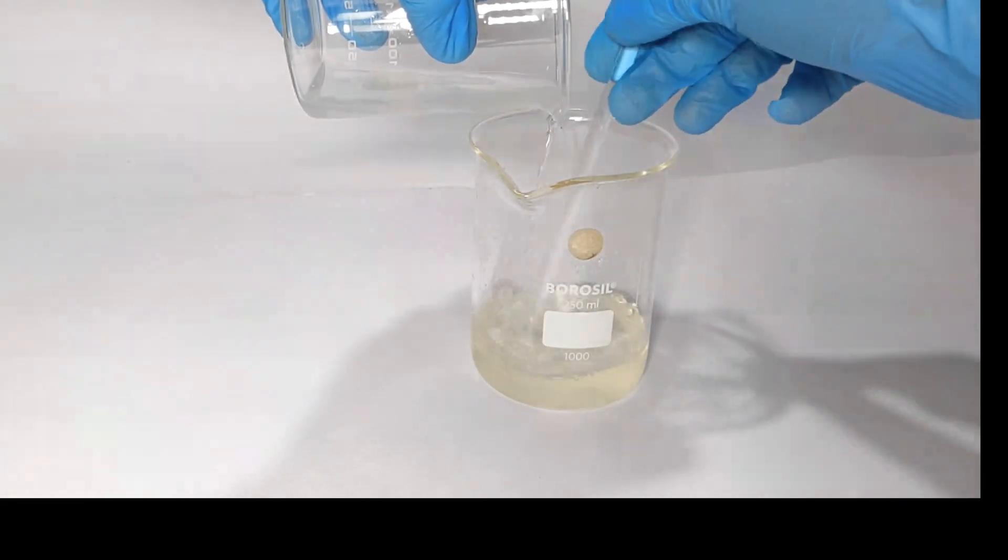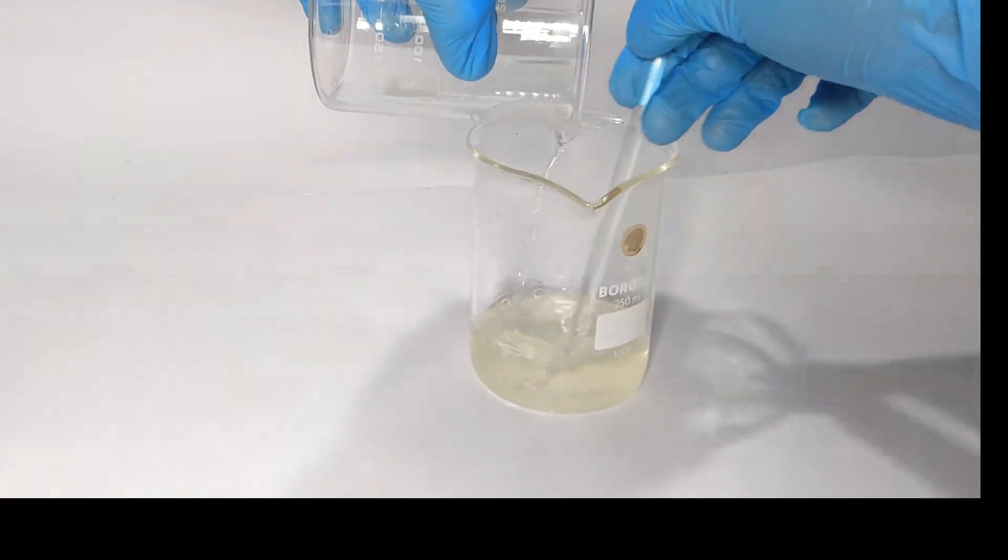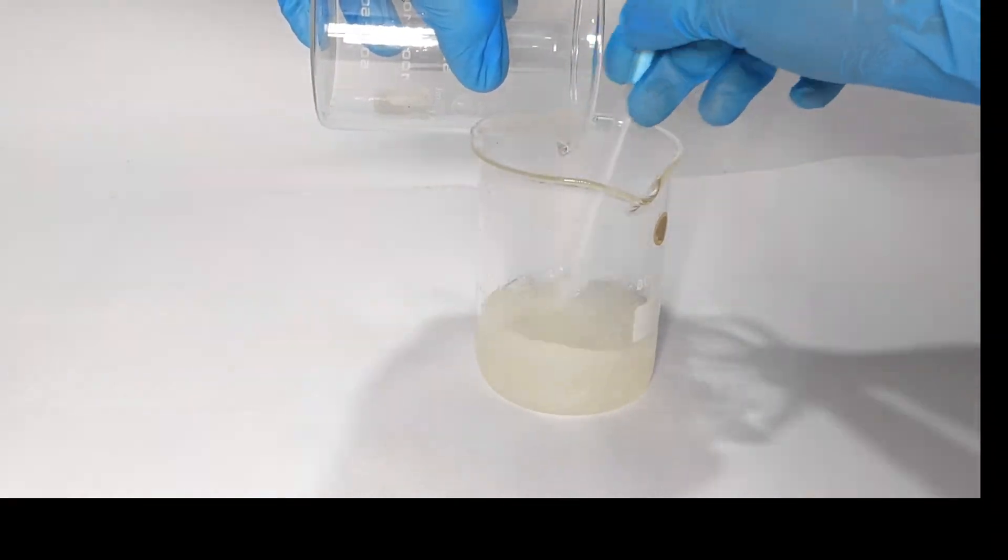Initially there is nothing much happening but once most of the lead(II) nitrate is added, a white crystalline precipitate crashes out and it becomes very difficult to stir the contents.